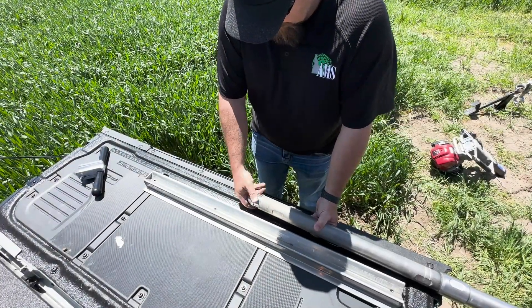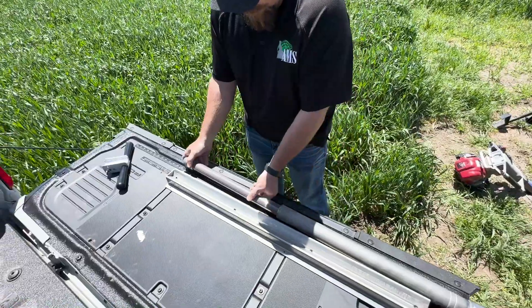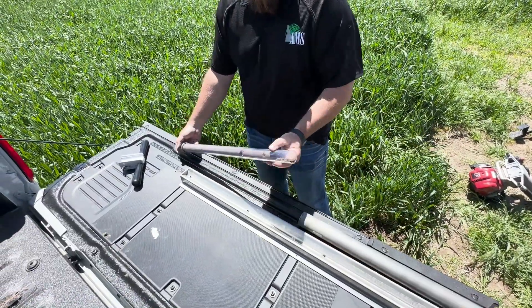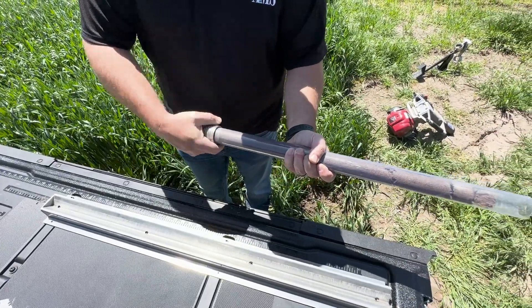Now let's retrieve our liner. Once the liner is retrieved, place the liner in the splitting tray.